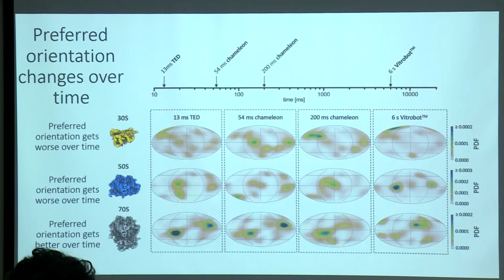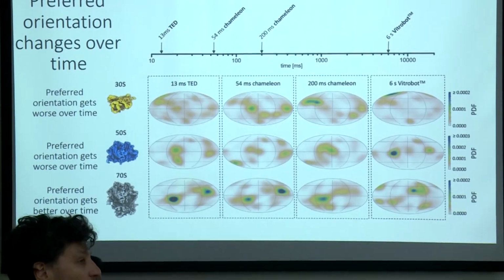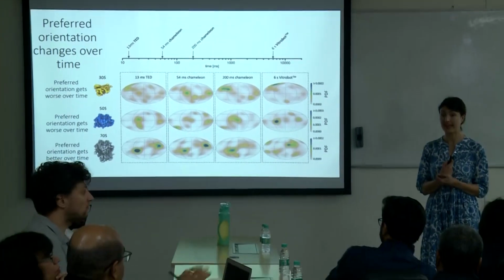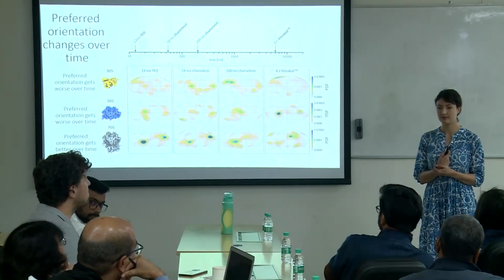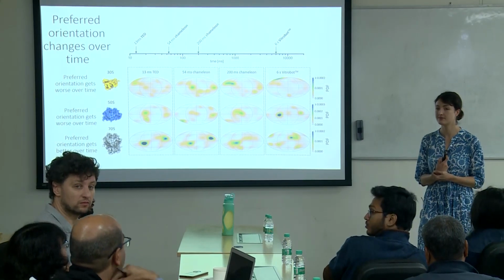So I think if we go back to, yes. Sorry, I just have a naive or practical question. Suppose your protein doesn't go to the air-water interface. What are the different methods you use scientifically to actually bring it onto the grid?